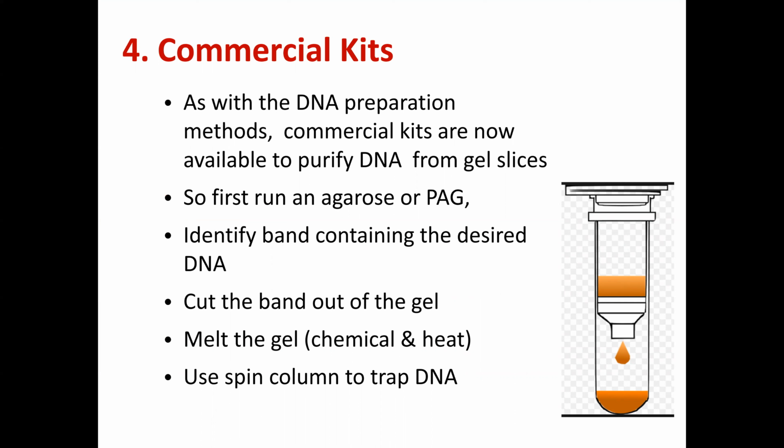Maybe the buffer is not working anymore, already expired, or the reagent is already contaminated. So if you are a microbiologist using commercial kits, please make sure to double check the protocols or the standards of the commercial kits that you're using for the experiment.